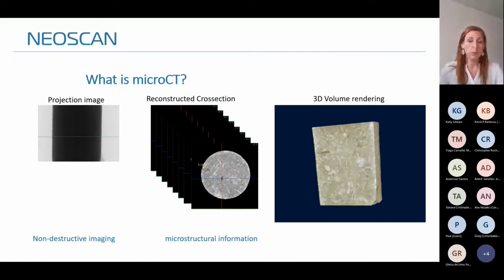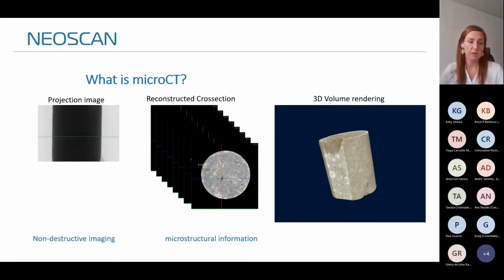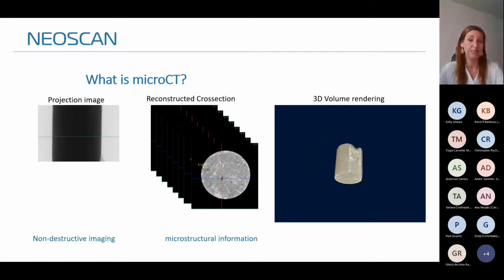Now, a few important keywords to remember about MicroCT. So MicroCT provides non-destructive imaging. It's non-destructive because we work with X-rays, and X-rays just travel through the samples. You don't need to cut the sample to be able to see inside the sample.